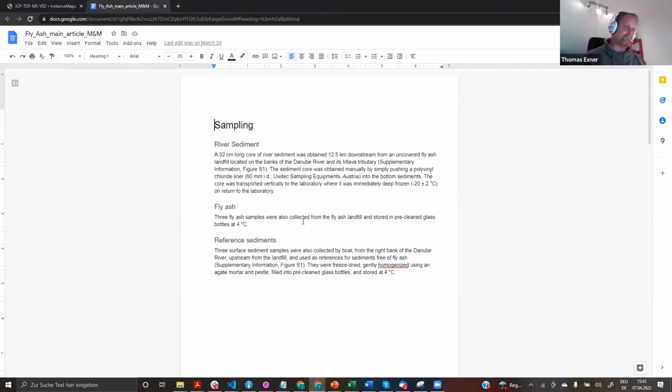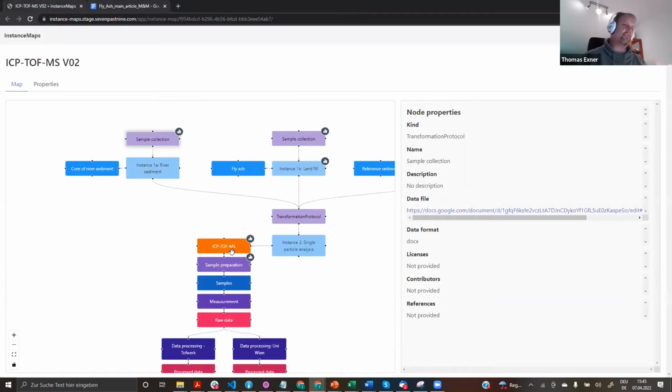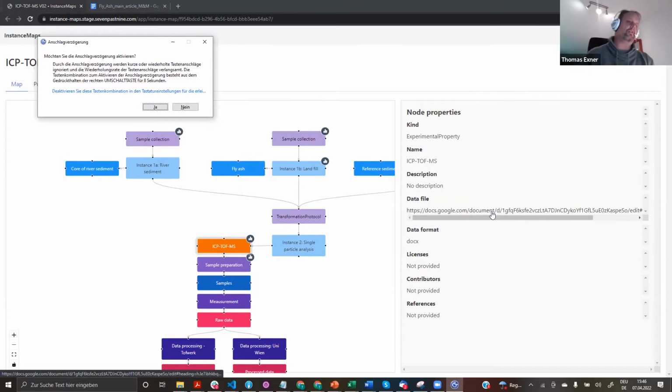Or this is an SOP you can link to, or something like that. Really making it as flexible as possible, so you can say, okay, I can start already with what I have, try to think about how to restructure that, and then put that together. And at the end, we want to be more harmonized and more computer readable as well, to get the data into more usable ways. But in principle, we can start with these little things, or with where you already are, and then continue.